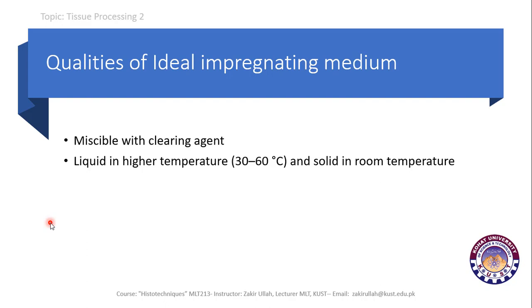The embedding medium should be liquid at higher temperature and solid at room temperature. It must have the quality that it is liquid at a higher temperature, that is 55 or 60 degrees centigrade, and if it is cooled down to room temperature, it becomes solidified.